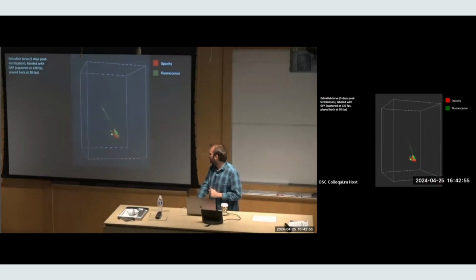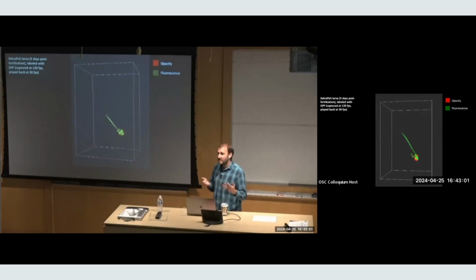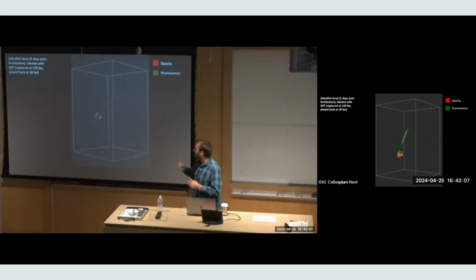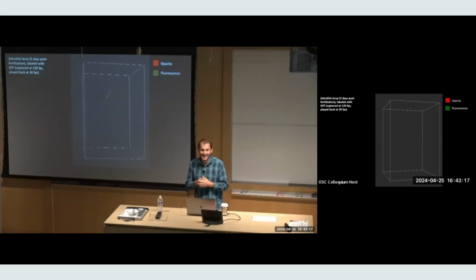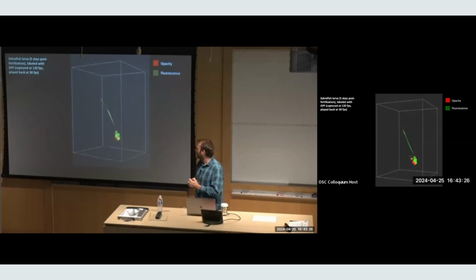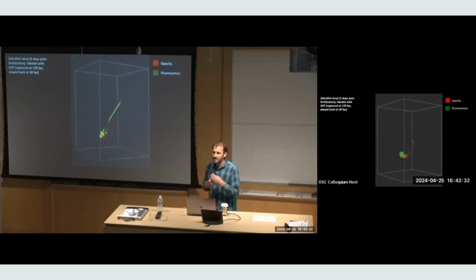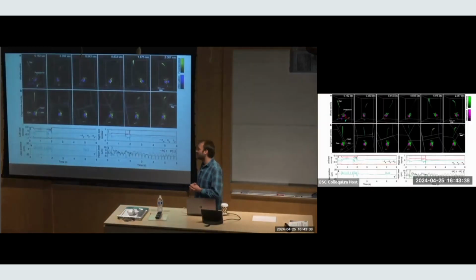But we can do that, and this is an example video of this zebrafish larvae, where red is showing its absorption, primarily in its eyes but also elsewhere in its body. It has pigmentation on its skin that's absorbing light, and green is the fluorescence being emitted. It's swimming around naturally, trying to get away from the bright blue light, I think, that we're shining on it. You can see it swam up out of the volume of view. It's in a long tube, so it can swim up and down. But we're beginning to try to move from this preliminary demonstration to actually showing some useful functional fluorescence measurements of brain activity, for example.